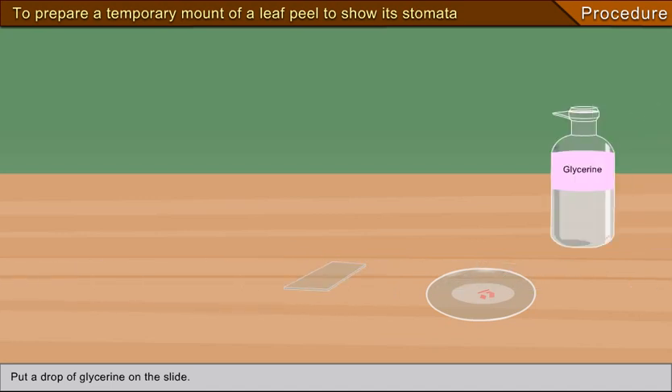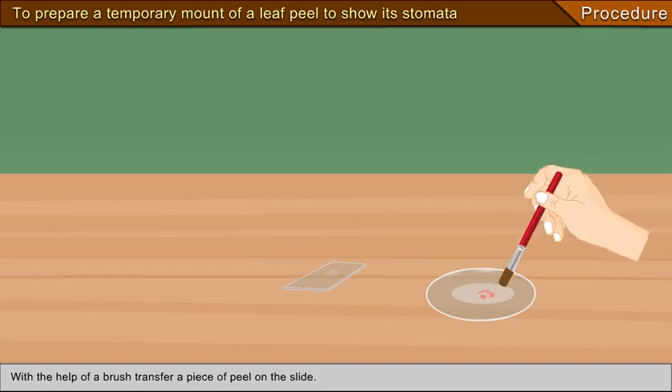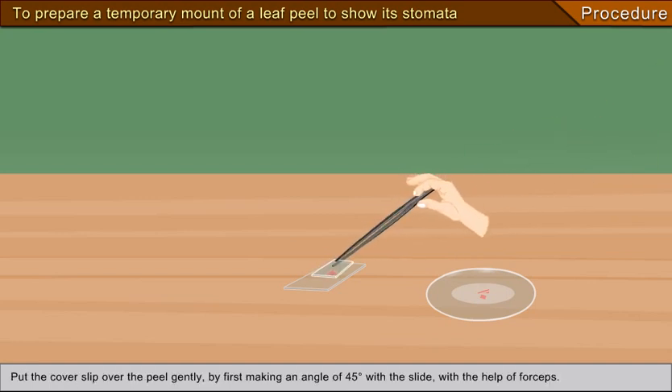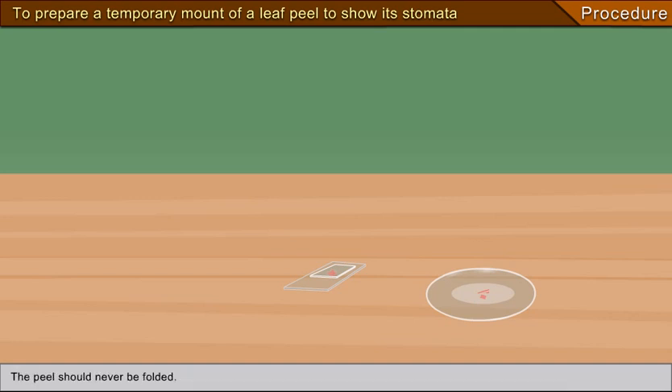Put a drop of glycerine on the slide. With the help of a brush, transfer a piece of peel onto the slide. Put the cover slip over the peel gently by first making an angle of 45 degrees with the slide using forceps. The peel should never be folded. Place the cover slip on the slide gently and gradually to avoid the entry of air bubbles. Drain out the excess stain using blotting paper.